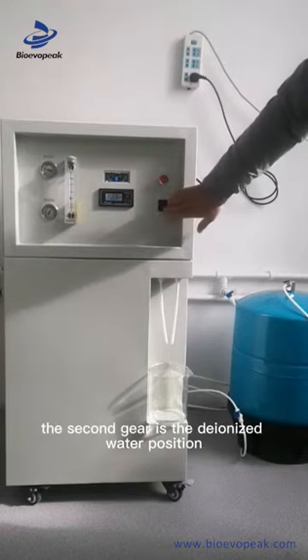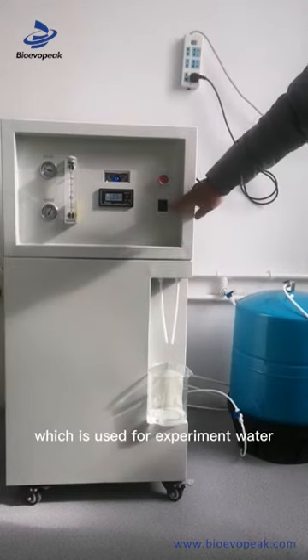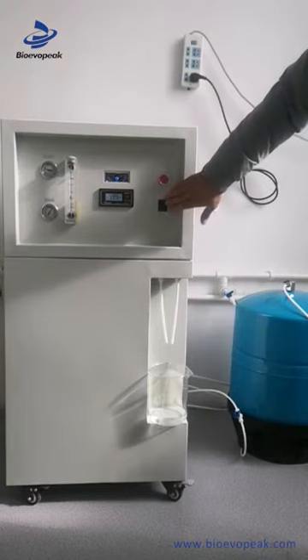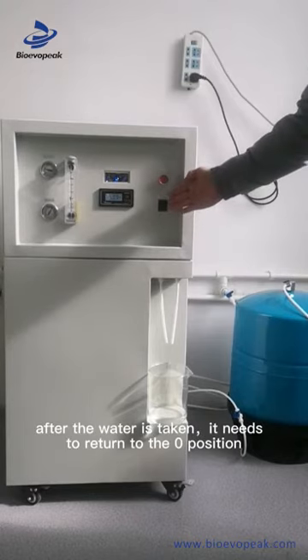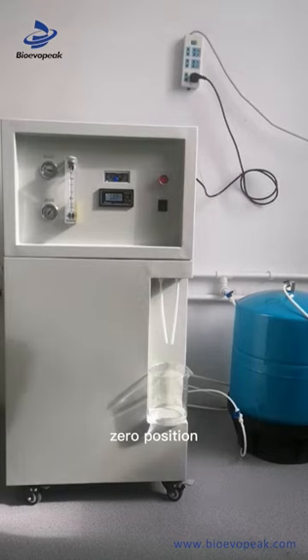The second gear is the deionized water position, which is used for experiment water. After the water is taken, it needs to return to the zero position.